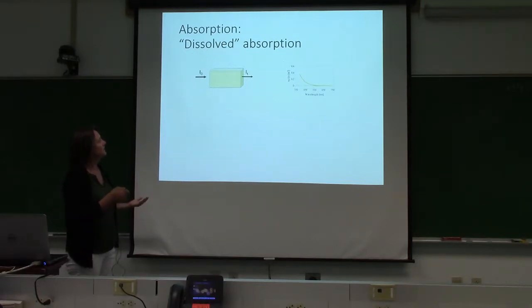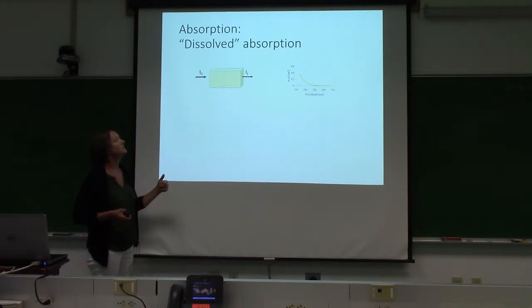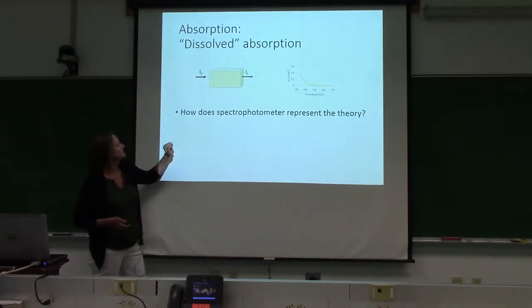So we fill our samples with some dissolved fraction, and in the lab today we'll be doing the 0.2 micron filtered samples. There'll be an incident beam and a transmitted beam. And let's see, what did I say?